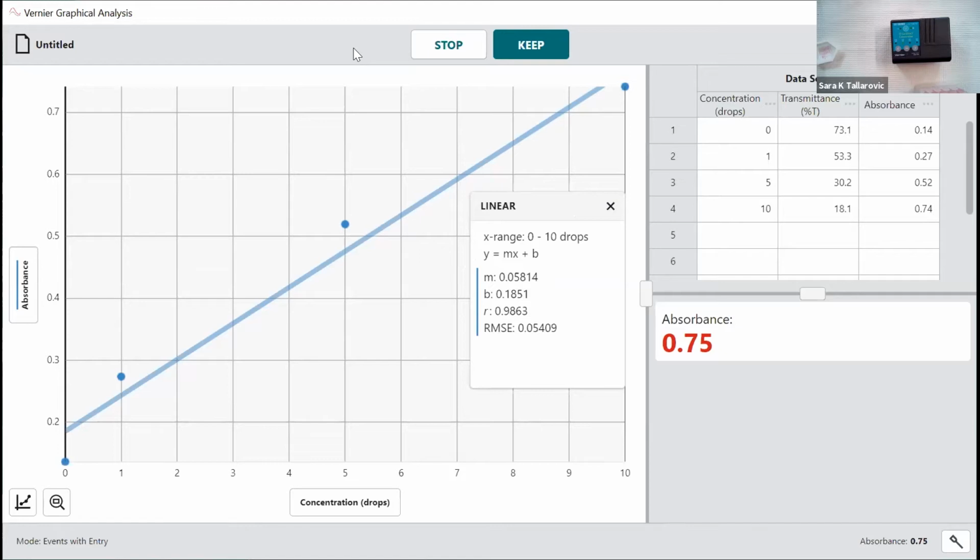All right, so I've done an analysis here. What I'd like to do now is, let's say that we're using the software in a scenario with remote teaching. If I had students that were not in the classroom with me right now, but I wanted to be able to do a live experiment and have them be able to collect the data as well, I can data share with them over the web.